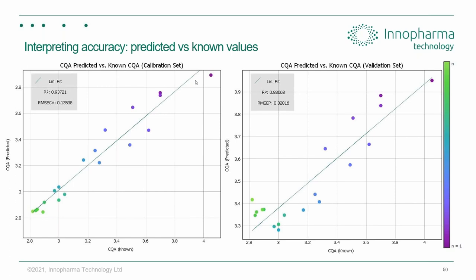So what's left over when we deduct the predicted value from the known value? And we can calculate the error on those residuals, which should be zero, right? If it was a perfect prediction, it would match exactly the known values. Where there is an error, that means our model deviated from the ideal, and we can evaluate the degree of those errors by looking at the distance between the zero line and those. That's why we take the root mean square of those errors. Okay, so rather than the sum, it's the root mean square. And again, how this works, we'll discuss in more detail.